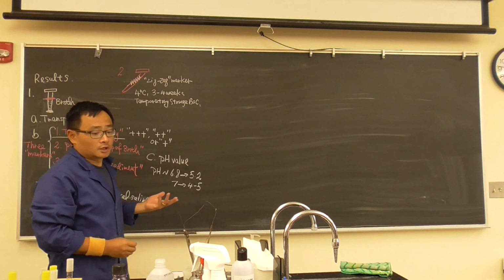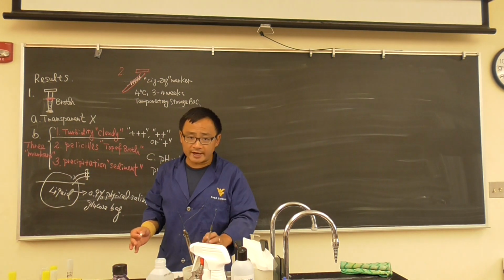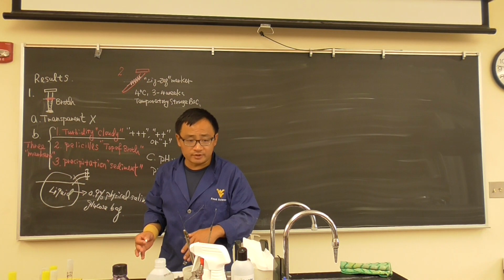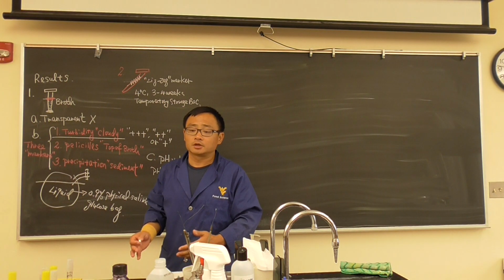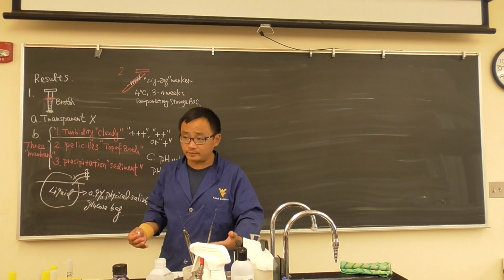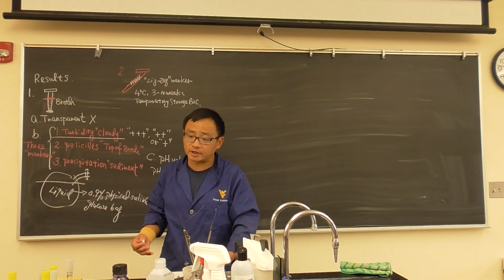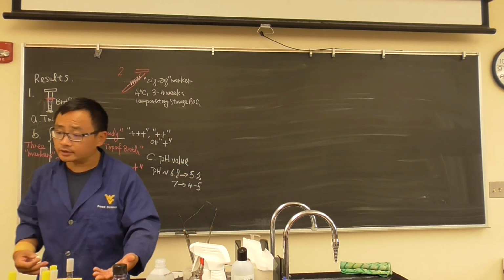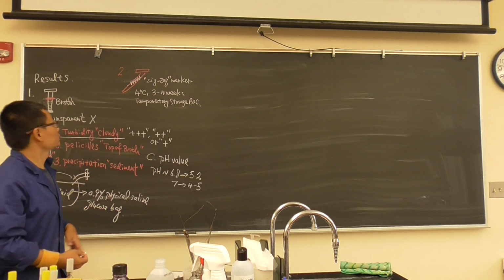Otherwise it will die. If you want to store bacteria for a really longer time, we have to add glycerin, use a semi-solid medium, and then we freeze it. Because the glycerin is a kind of freezing protection for the bacterial cell to not be damaged by freezing. Because freezing will generate crystals, and the crystals could kill bacteria. If we put the chemical glycerol there, the cells will be protected. So that's something else. Okay, that's the second one.